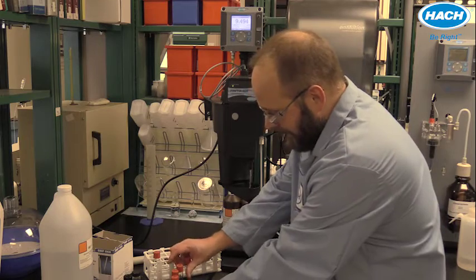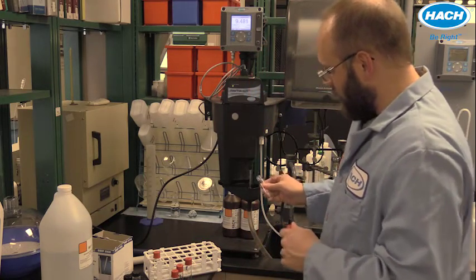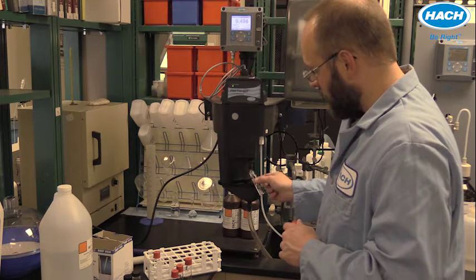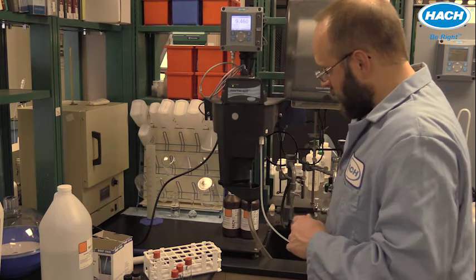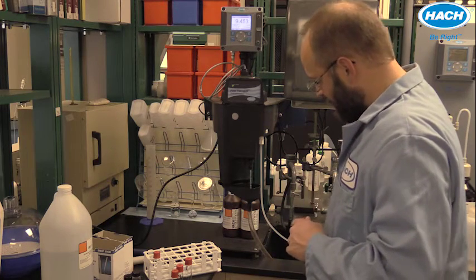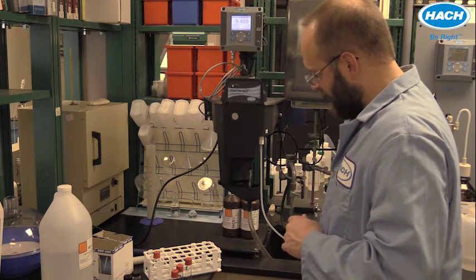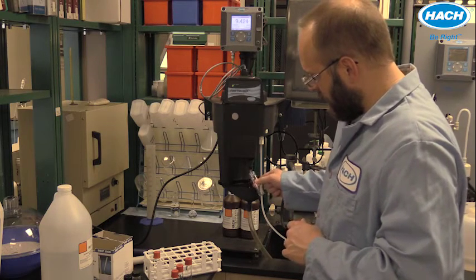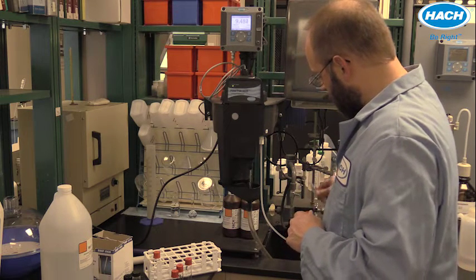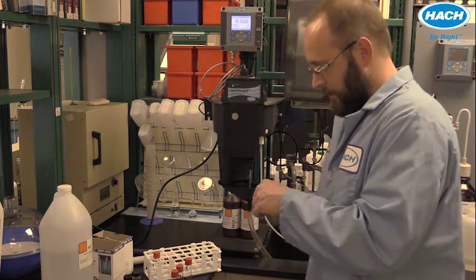Then I'm just going to take the sample right here from the turb outlet as the water falls into the drain filter. I'm going to rinse the vial a few times with the sample, and then fill to the line that I've marked for 15 milliliters.